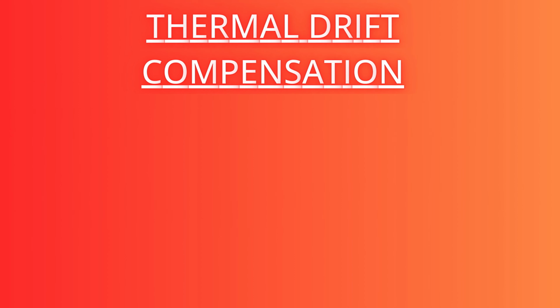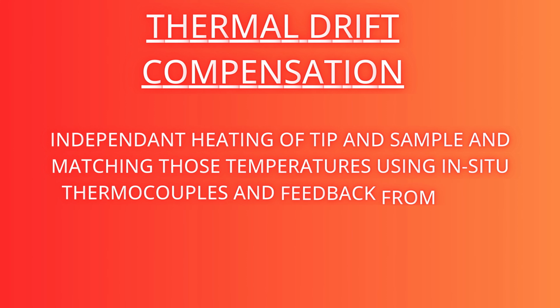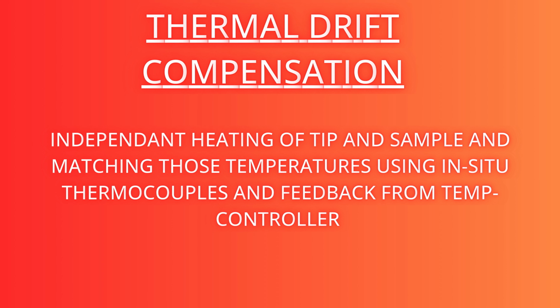So thermal drift is the unintended movement of the indenter tip due to expansion or instability caused by the heating. So to work our way around that, we can use thermal drift compensation. What can we do, for example? We can independently heat both the tip and the sample, using a laser maybe. Doing so, we can match those temperatures precisely to reduce the thermal mismatch at the contact interface.